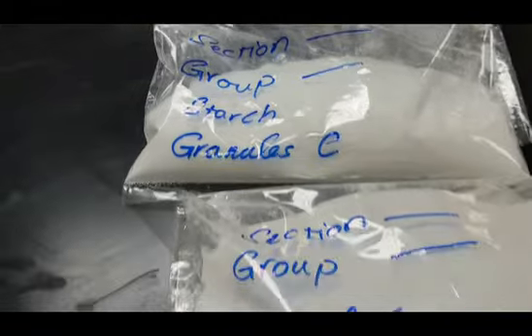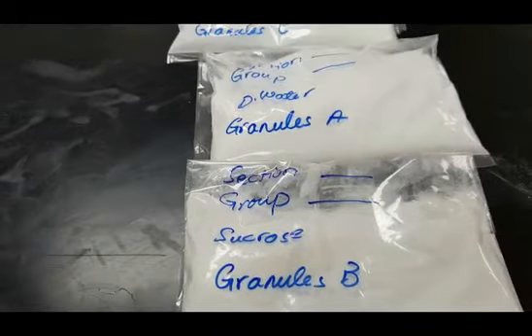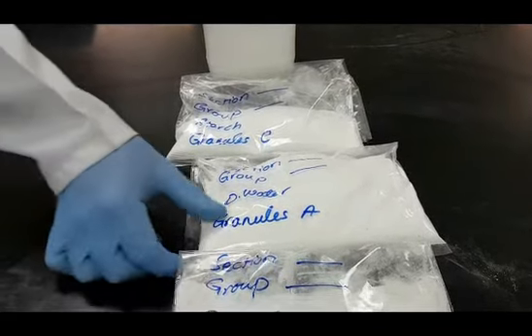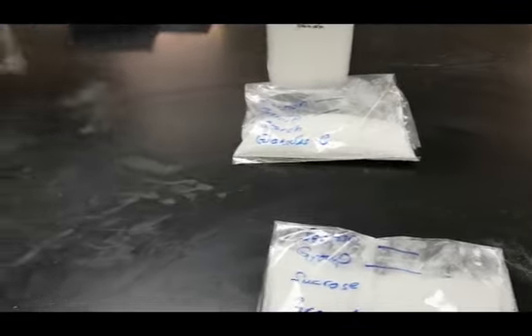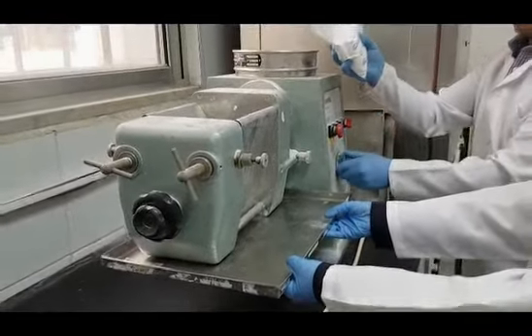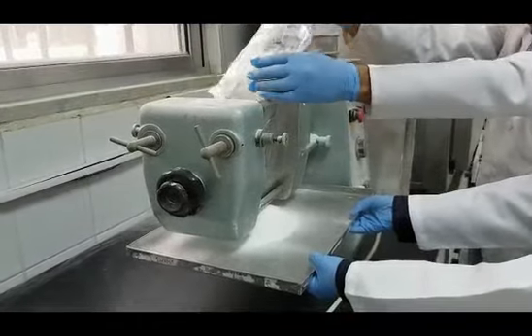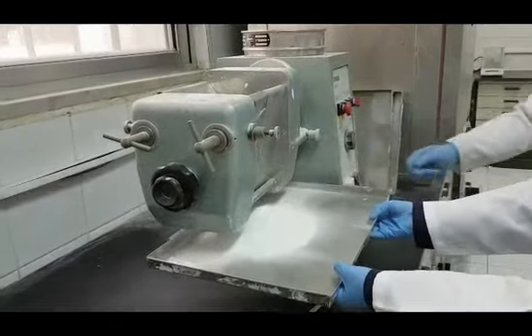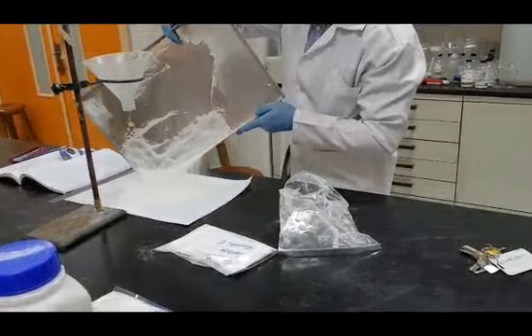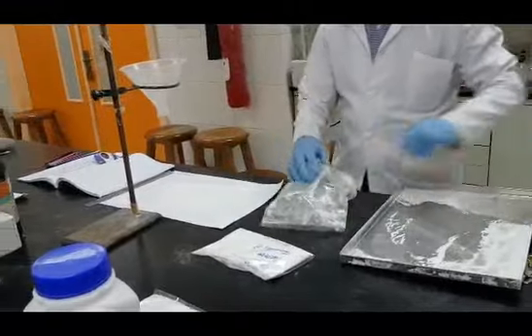The very first step is to regranulate all granules you prepared during the granulation experiment in cycle 1. Regranulate using the oscillating granulator. Once you do so, please return all granules to the same plastic bag.